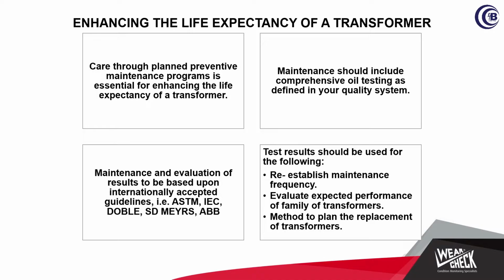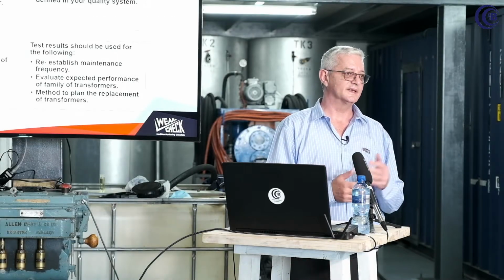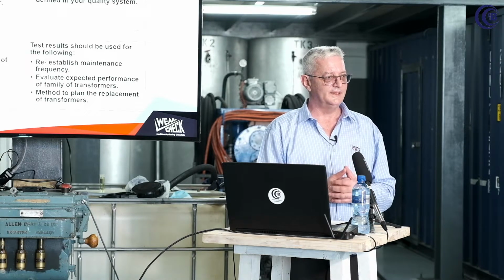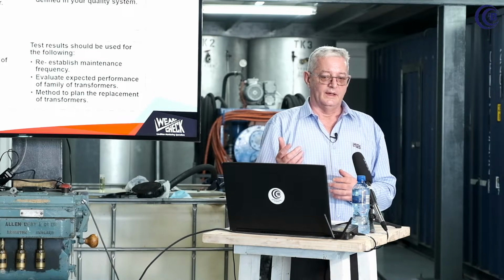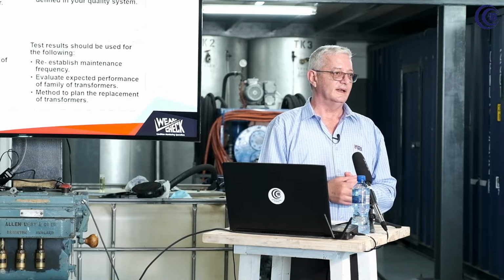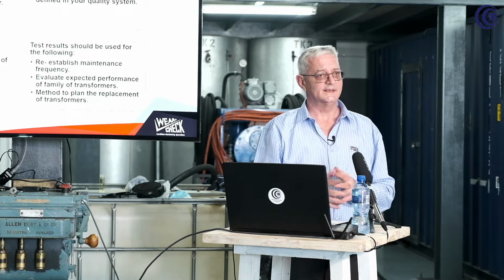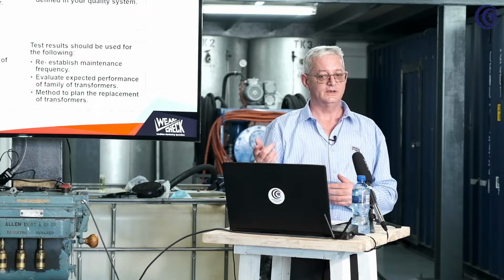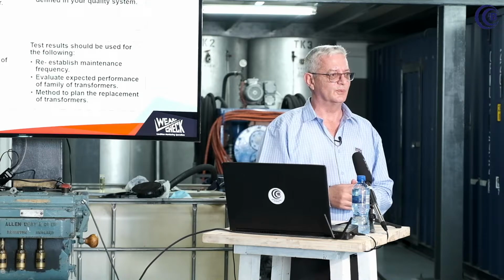And you need to look at all this, and there's various methods. You can look at ASTM, Doble, SD Myers, ABB. There's quite a few methods you can use in your preventive maintenance that you have to look at, and we are looking at most of them. ASTM and IEC is in all probability 95% of all our tests as well as our diagnostics that fall in that category, but there's others as well, and we are going to look at some of those in a short while, the type of diagnostics that one can do.